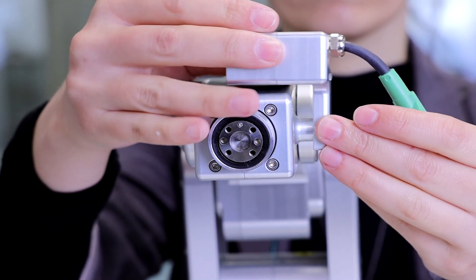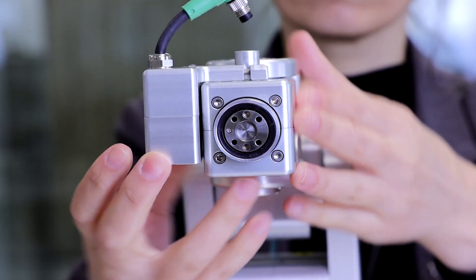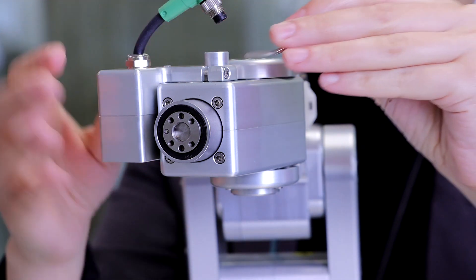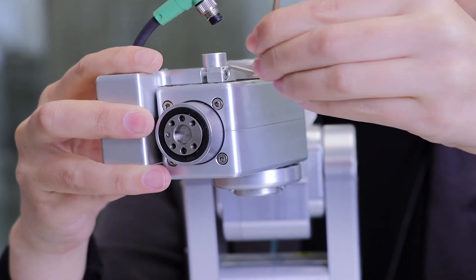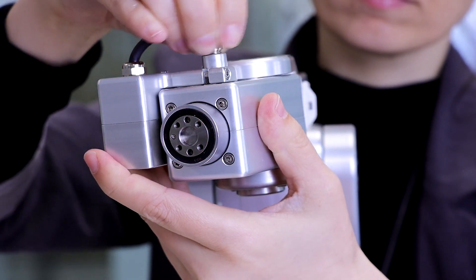Position the module on the wrist of the robot and align with the electrical connector. Secure the module by tightening with a 2.5 mm Allen key. Connect and secure the electric cable.